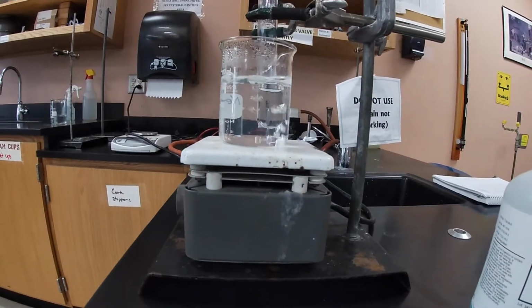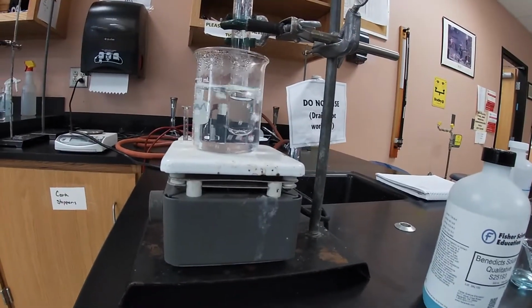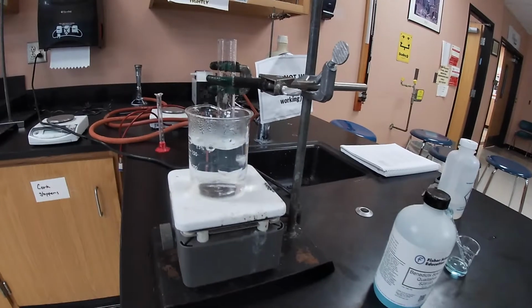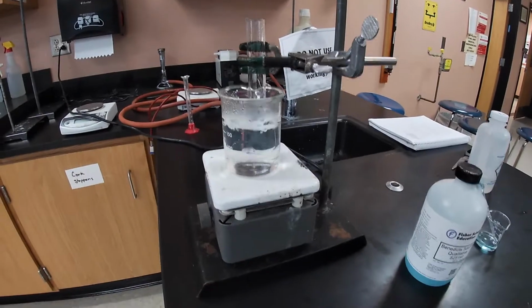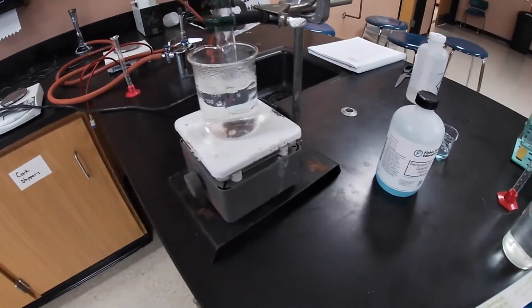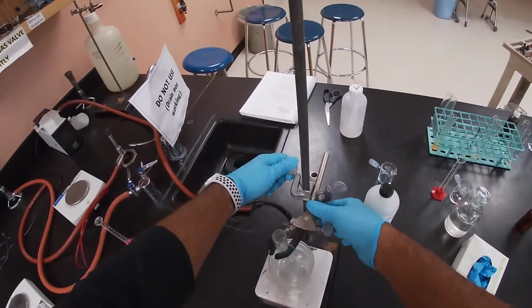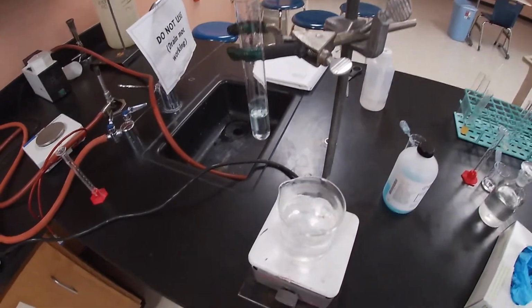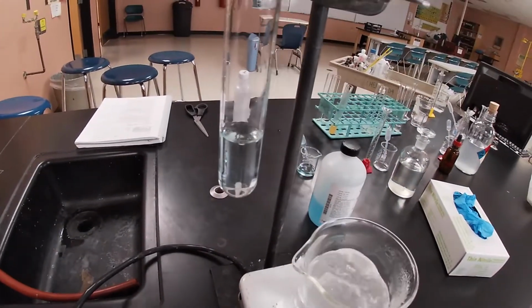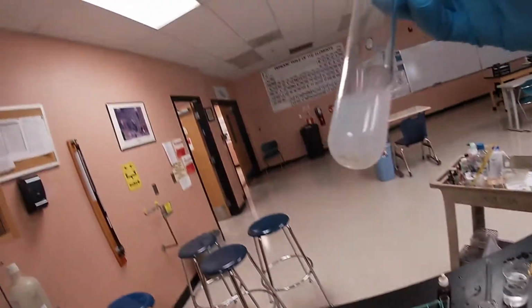After our 5 minutes, you can see no hint, right? It's still clear. We were expecting a yellowish color in comparison to what we got for our standard. So definitely it's still bluish in there. So no glucose, right? So we're gonna go ahead and remove it from the heat. And as I removed it from the heat, you can tell that, again, still kind of blue, therefore no glucose present.